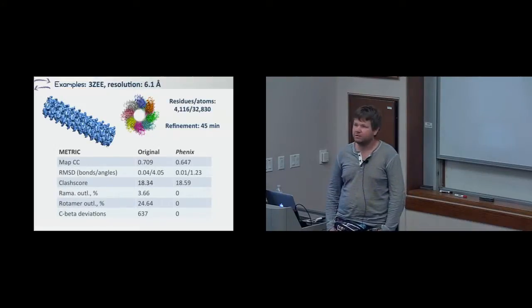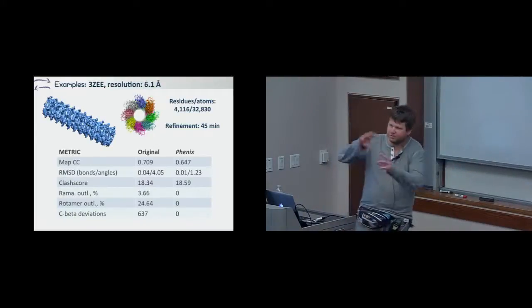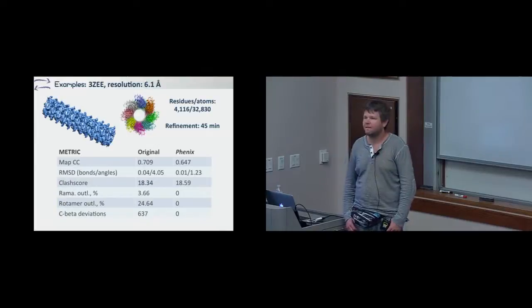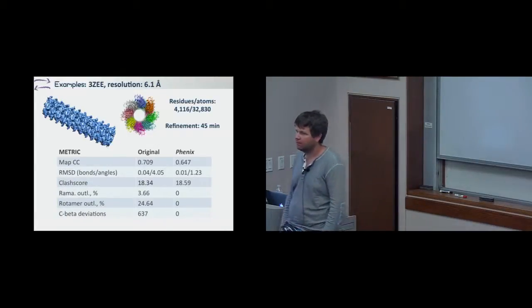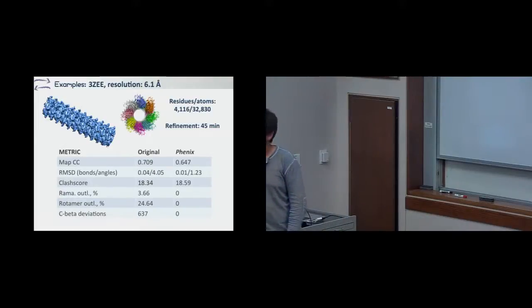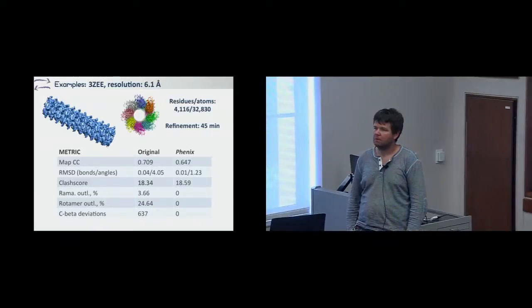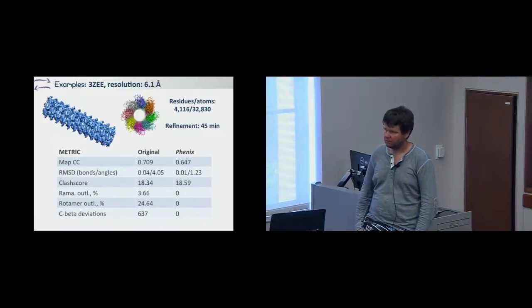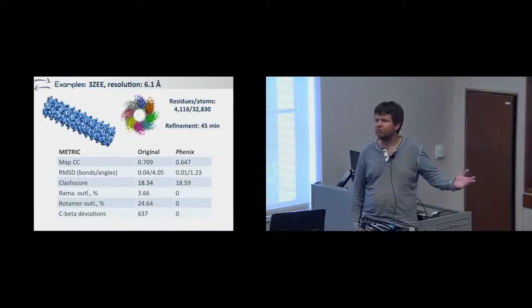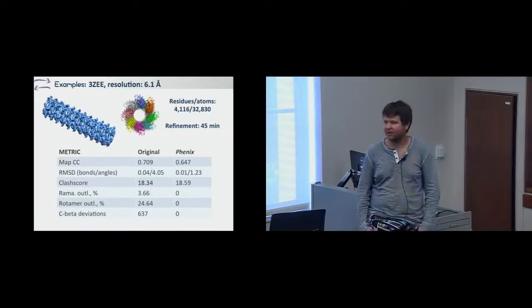Yeah, that's definitely good. It's among the inputs. Just didn't have a place to show that graph here. And I think, while I use the right term, this procedure is an optimization. It's not refinement unless you actually produce a new map from that and then do this again. Yeah, it is an optimization. So you don't produce a new map because your map is static.